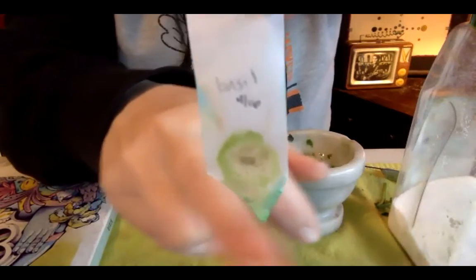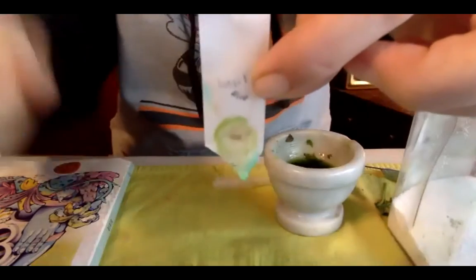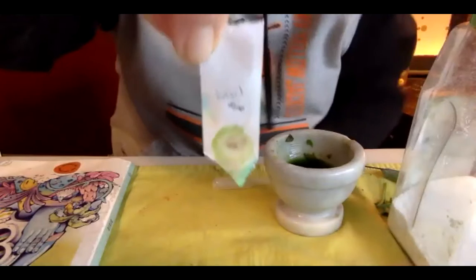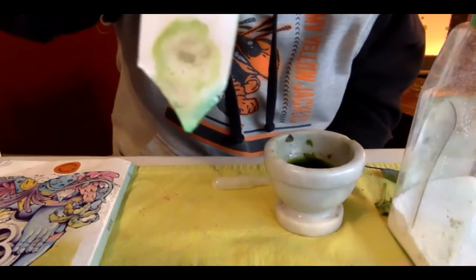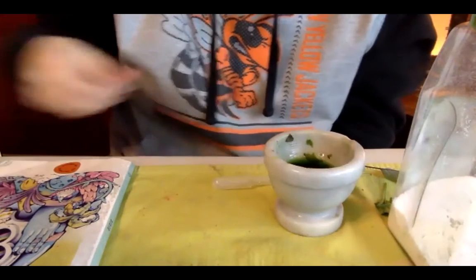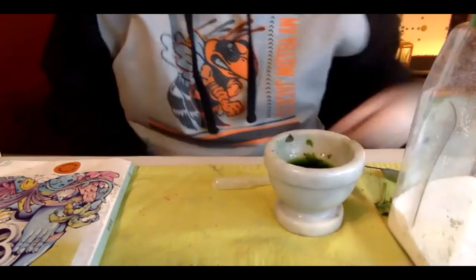Ignore the blue stuff. This stuff and this stuff, that's stains from another thing. So that was like the best I got yesterday without being able to use the chromatography solution. That probably would have helped a little bit because that is made of acetone and ether. So a little different. But the isopropanol works pretty well.